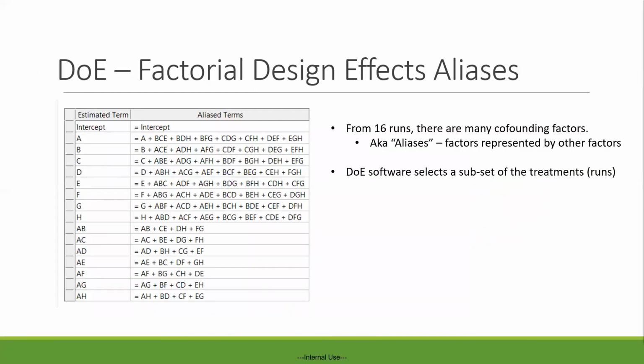When we choose a fractional factorial, we eliminate some of the combinations of the factors. As a consequence, aliasing or confounding occurs when using fractional factorial, and one combination represents several others. In particular, these are the aliases in the resolution 4 design that is being used to demonstrate. Alias is the confounding of interactions between factors. This is baked into the experimental design by the software.